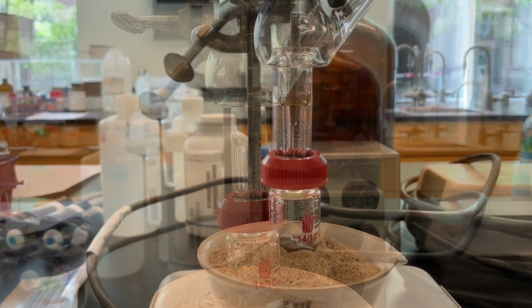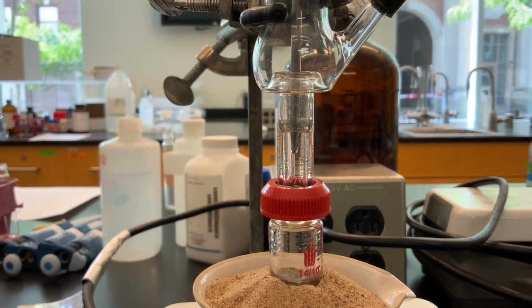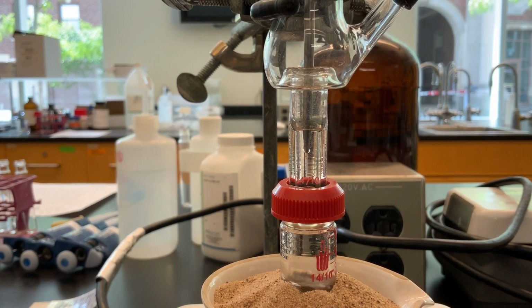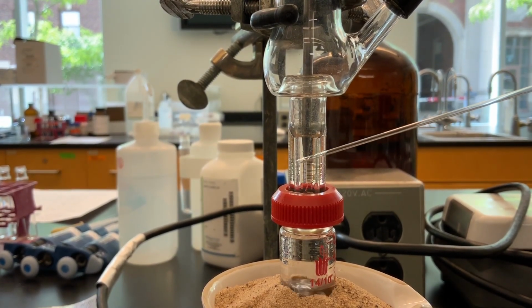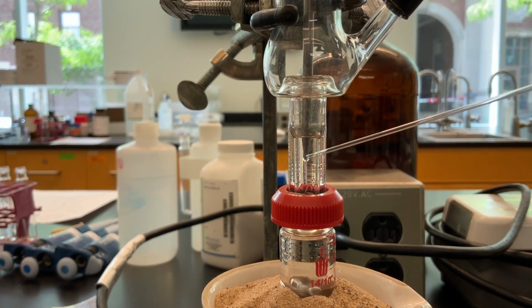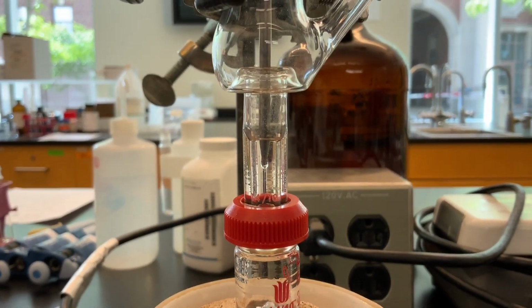All right, so the vapors now have finally traveled past the screw cap, and we can see that they've now started to condense on this portion of the glassware, and also look at that droplet on the very tip, the base of the thermometer probe.